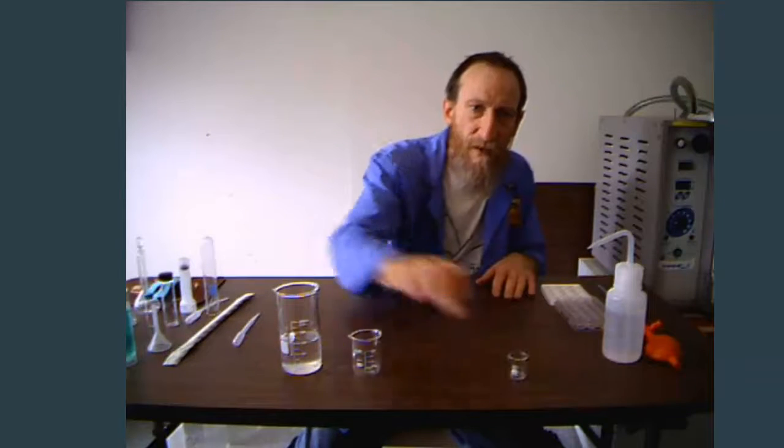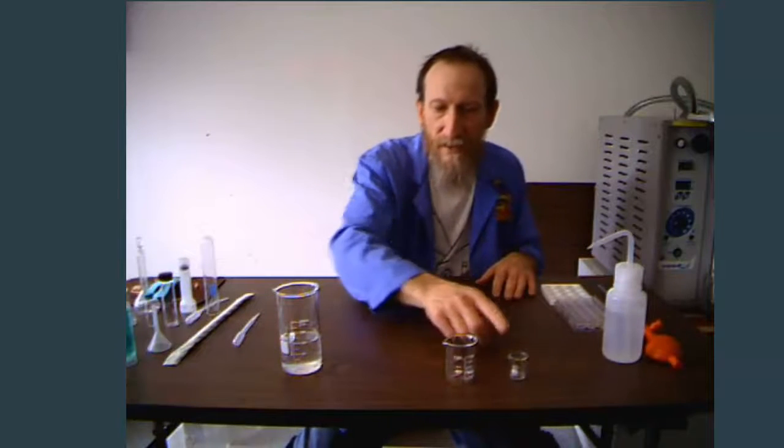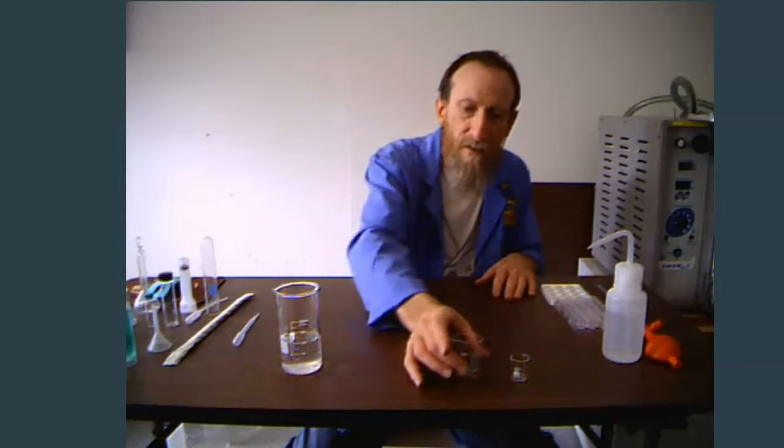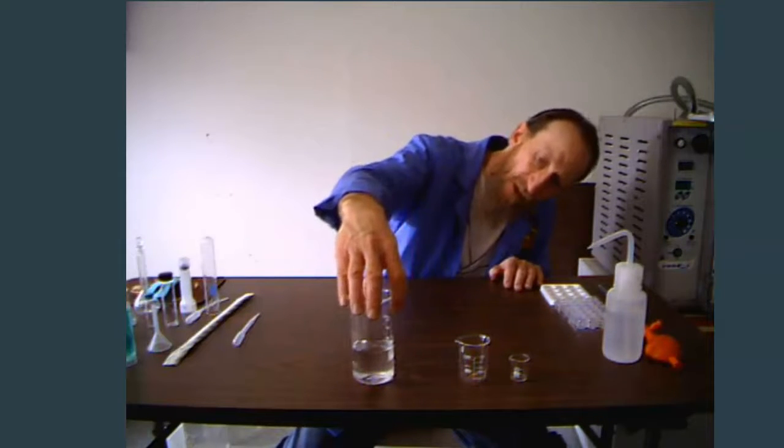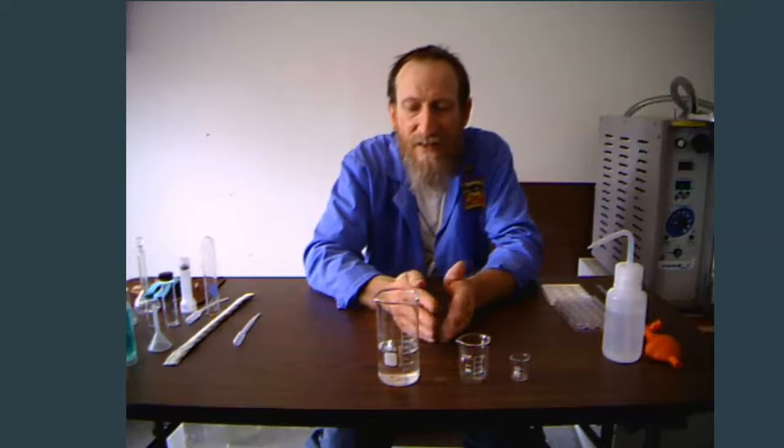The first thing I have are three different beakers: the small 10-milliliter beaker, a larger 50-milliliter beaker, and this tall-form beaker, often called a Berzelius beaker. Beakers are very, very approximate — this one has about 120 milliliters in there, but that might be anywhere from 110 to 130 milliliters depending on the manufacturer. The markings on it are very, very approximate.